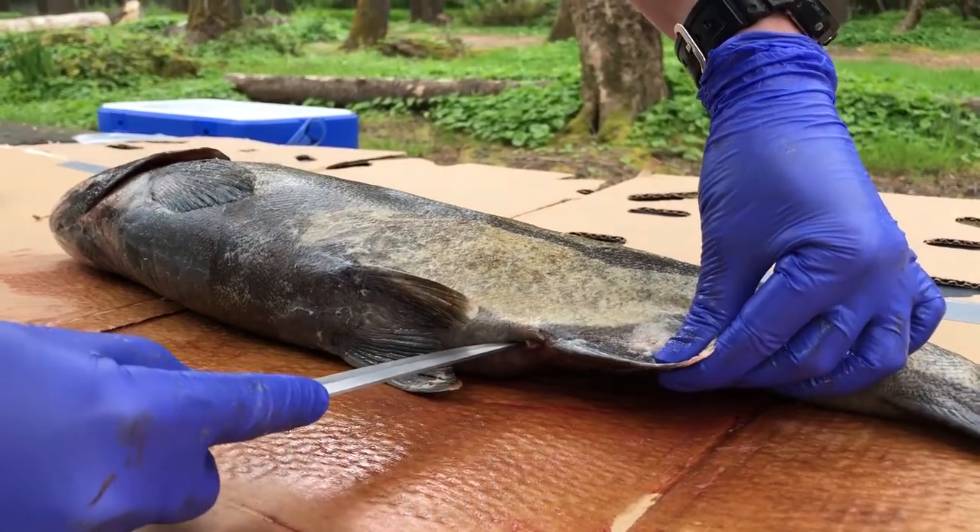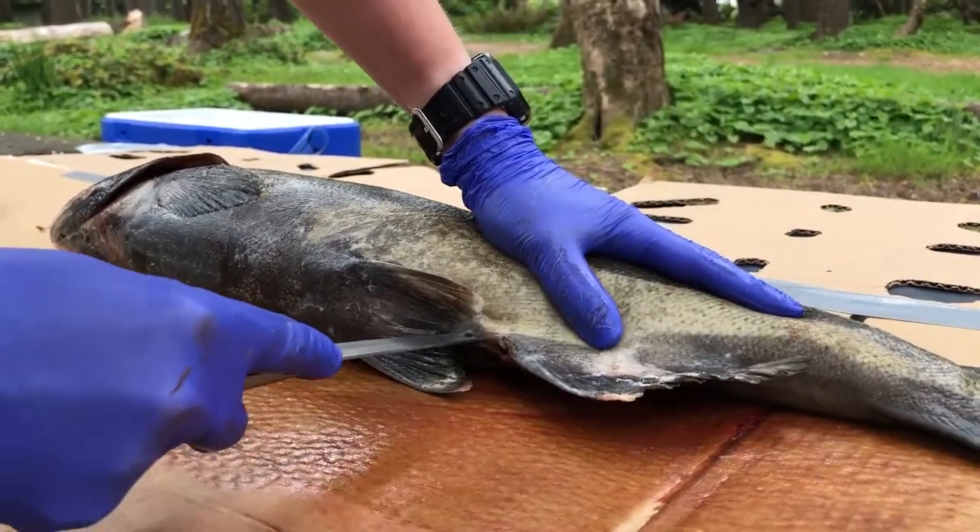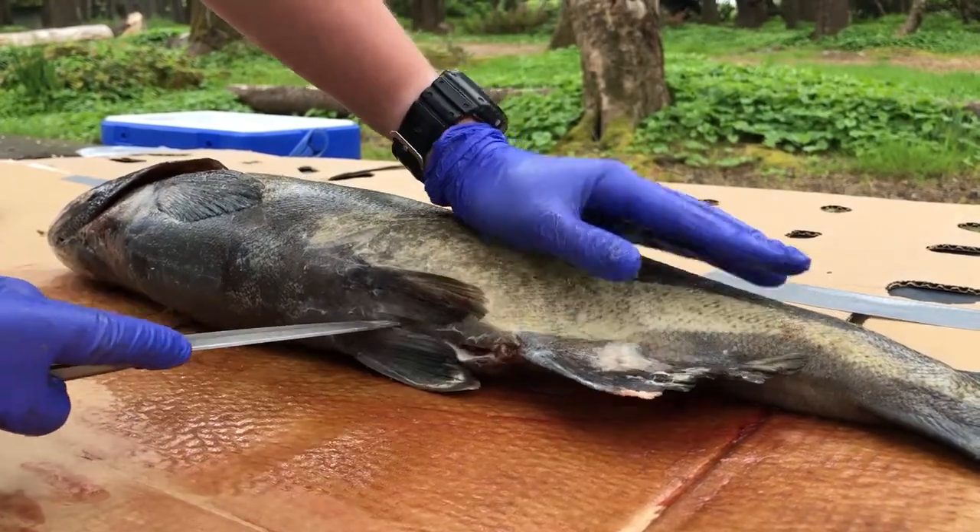We are going to start here and I'm just going to make careful cuts. Try not to go too deep.